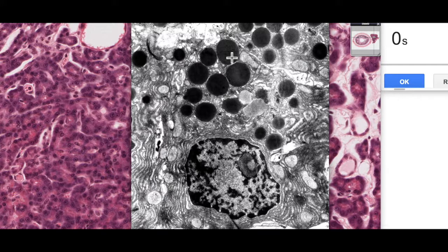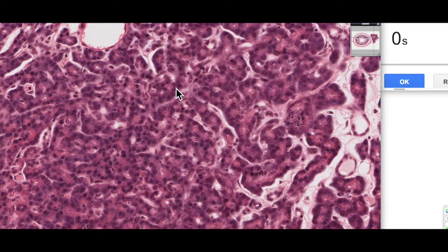Because it's protein, very acidophilic and time has just gone, very acidophilic and therefore stains with eosin. So if we have a look again, we can see this basophilic basal region, acidophilic apical region and that you can really begin to interpret staining patterns and then begin to identify the composition of these cells.